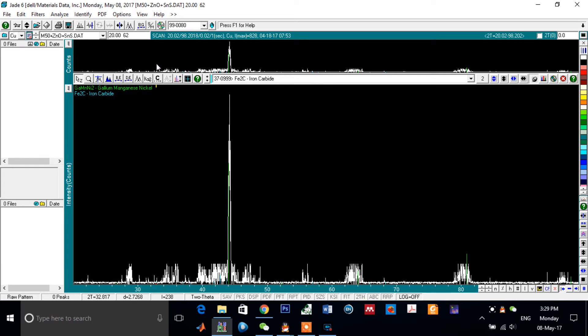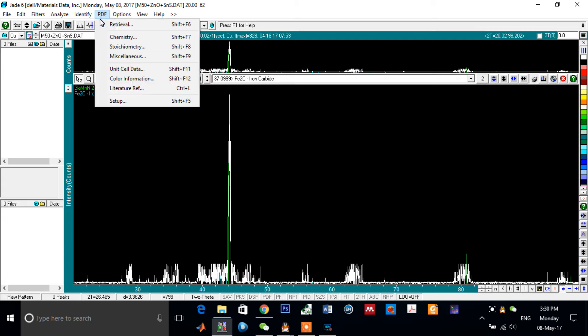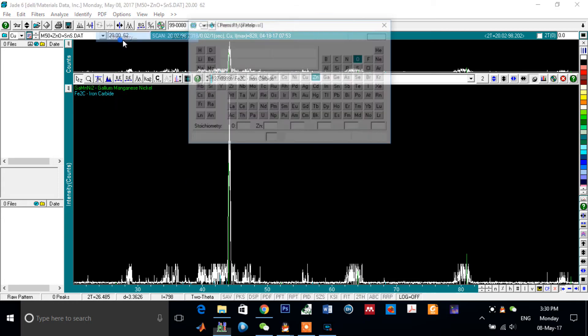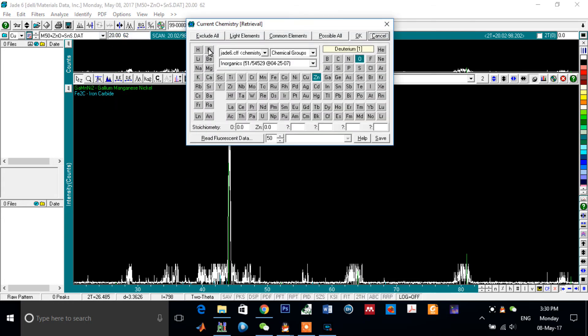And something more, in addition to that, if you want to search for specific chemical composition or specific formula, click on PDF, Chemistry. First of all, this window appears like that.